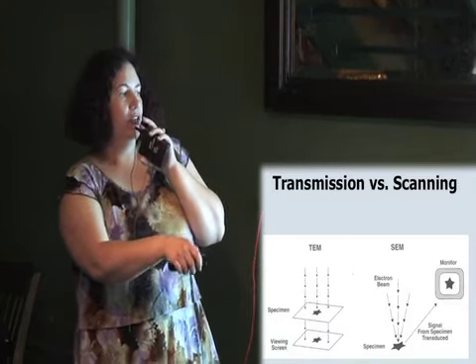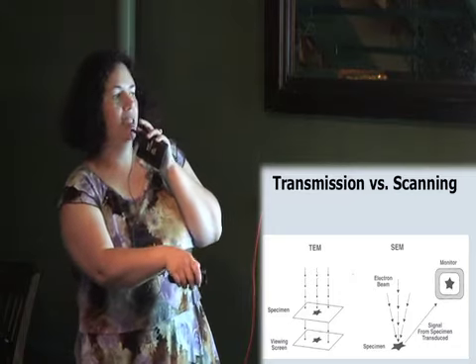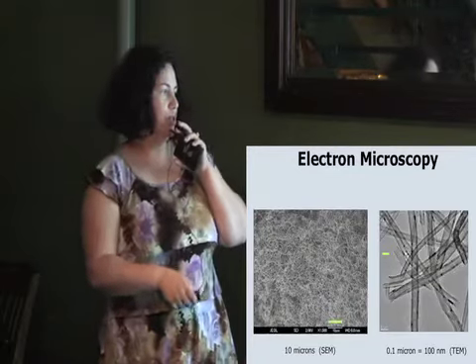So basically, there's a difference. The scanning electron microscope hits the sample, the electrons will interact and we will collect them. The transmission will observe the electrons that are passing through. For that, the specimen has to be very thin. If you have a sample that is too thick, the electrons will always stop on the way. This is the type of difference that you observe between these two.